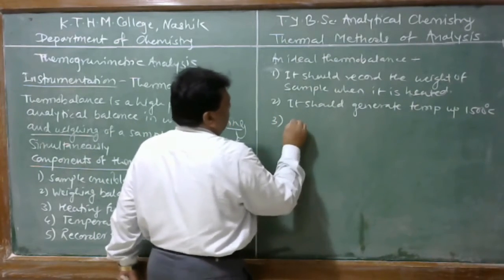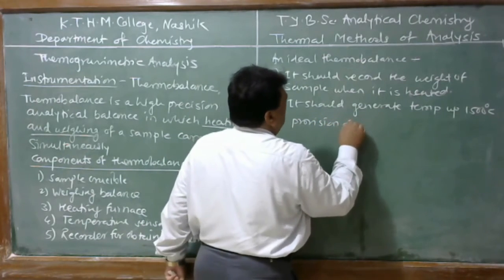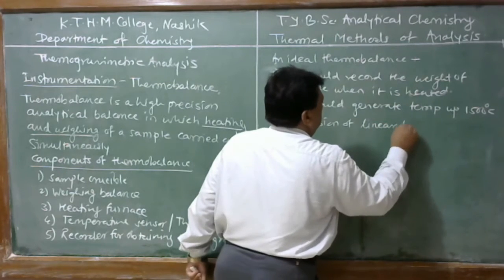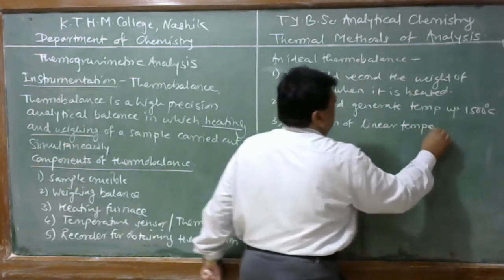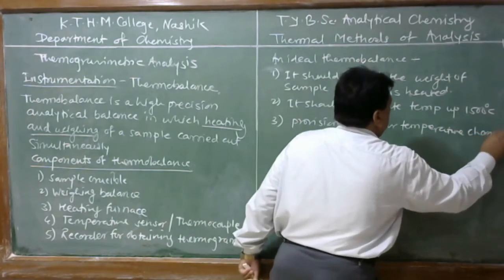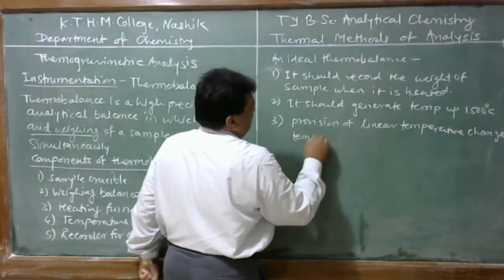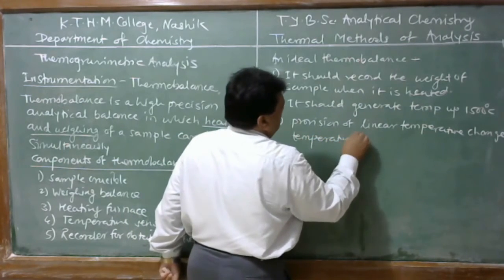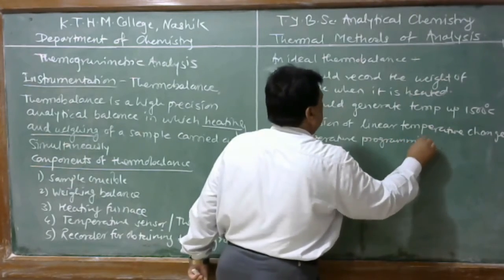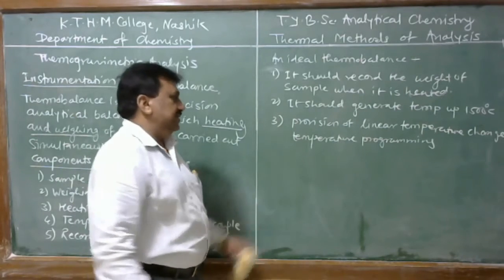There should be provision for linear temperature change, or a provision for temperature programming. That means we can program the temperature for a particular analysis.